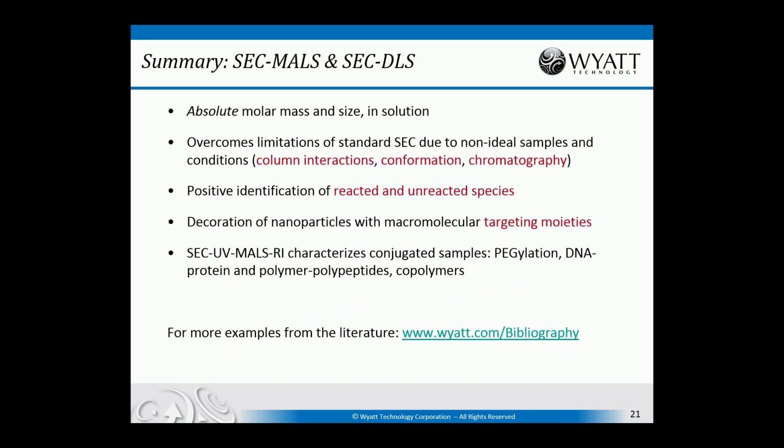So to summarize, tool number 4, which includes SEC-MALS, you can also add the DLS detector online. I didn't show examples of how that's used, but it can be used to look at conformations. We'll see some examples of how that's used with the next tool. We're measuring distributions of molecular weight and size in solution absolutely without reference to reference molecules for calibrating columns.